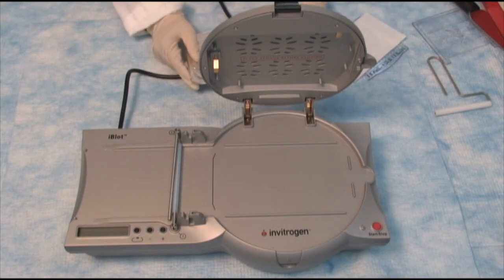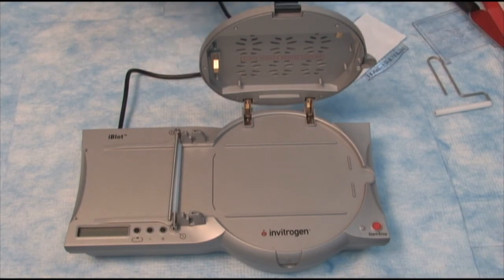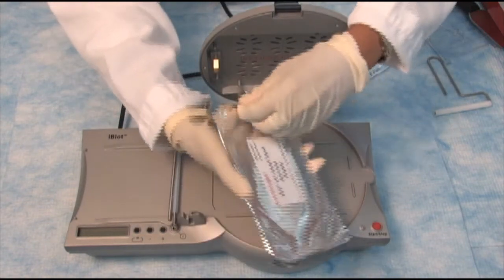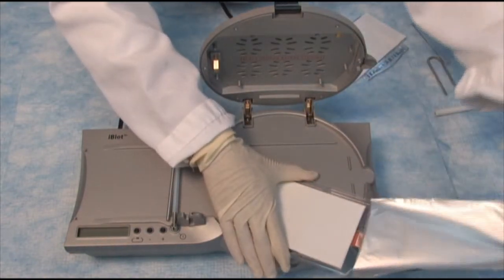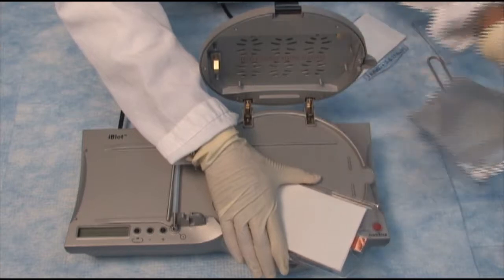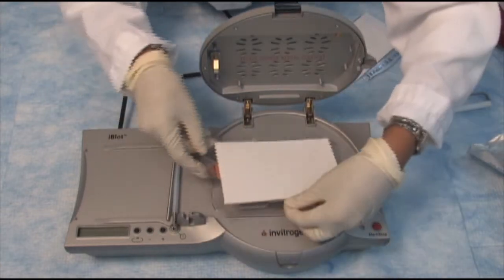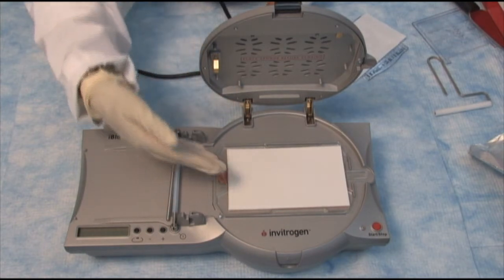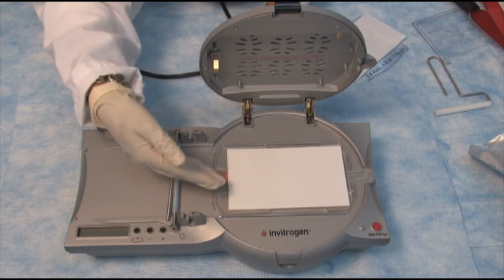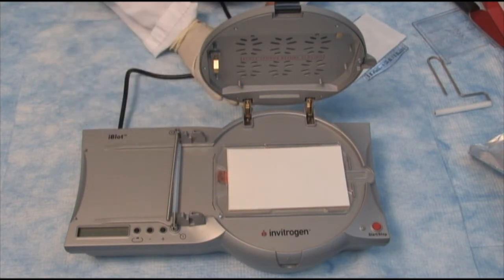Using the iBlot system is very easy. You begin by unwrapping the bottom stack, remove the aluminum foil, and place it in the device. The membrane is already preassembled in the stack, and again you have a choice of PVDF or nitrocellulose.